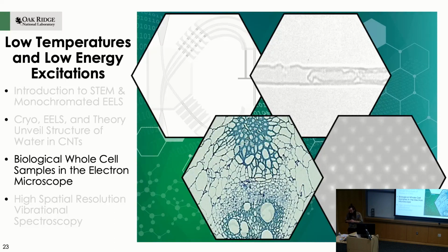But the pressure inside the microscope itself is 10 to the minus 9 torr. So we're at extremely ultra high vacuum. So I sort of imagine the pressure can't be that high inside the tube, right? Yeah, I mean, there's a set of literature on these encapsulated, high pressure bubbles, right? So I don't know. Yeah, I guess it's anybody's guess. Yes, exactly. And how you'd measure it and how you'd validate those measurements is something I'm very interested in, but I don't have a great answer for right away.